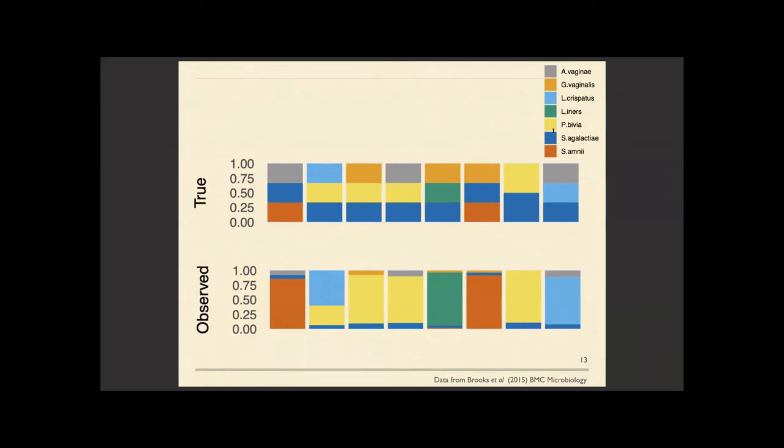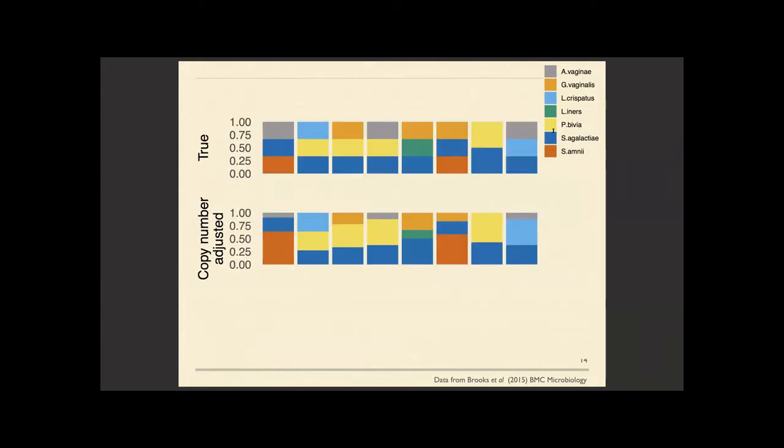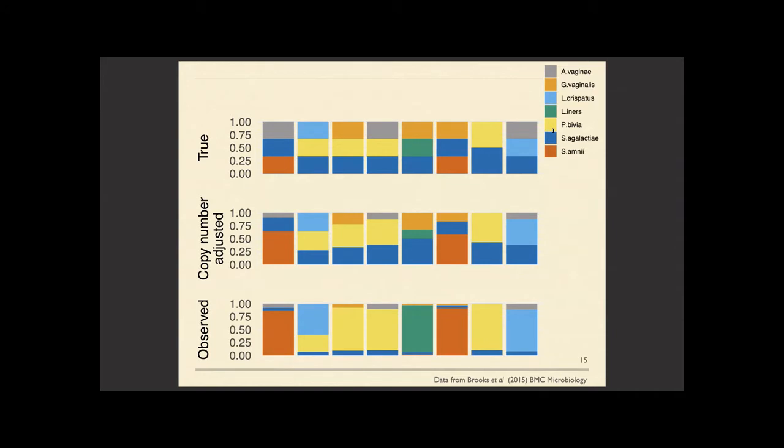So this particular data that I'm showing is 16S sequencing. A really natural question that a lot of folks ask is, well, do all of these taxa have the same copy number? And could copy number variation be accounting for the distortion between true and observed relative abundance profiles? So here are the true abundances of the taxa adjusted for variable copy number across these organisms. We see that maybe it sends us further in the direction of the truth, but it's certainly not accounting for all of the deviations between observed and actual relative abundances, even copy number adjusted, in our community.